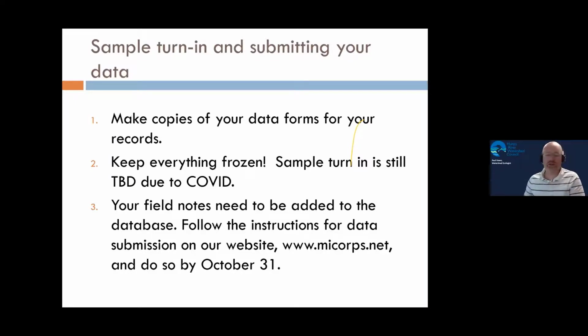Okay, so just continuing on, some best practices here. Make sure that you're copying your own data forms for your records, and you'll be submitting one of those in with your samples. Keep everything frozen. Those filters, once they go in your freezer, leave them there until it is time to do the turn-in.